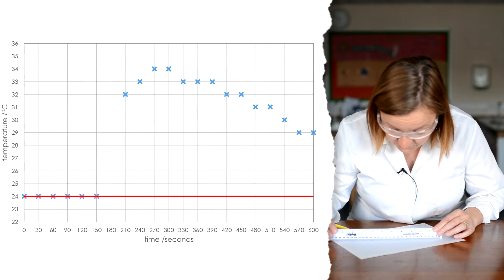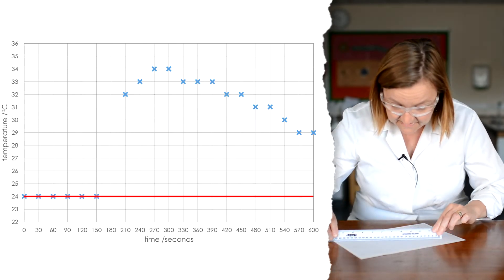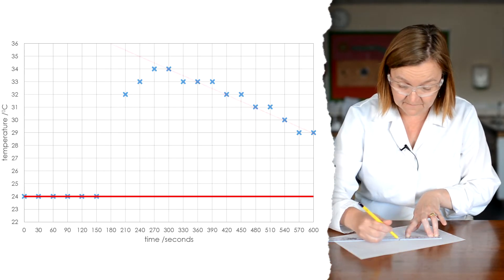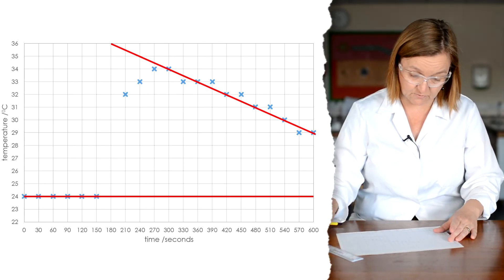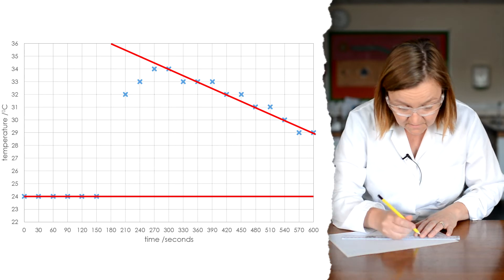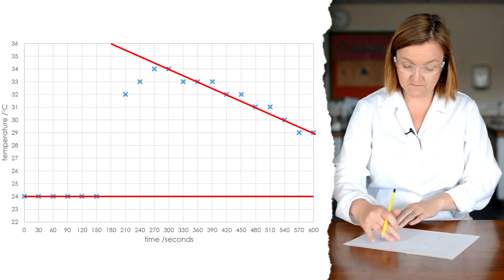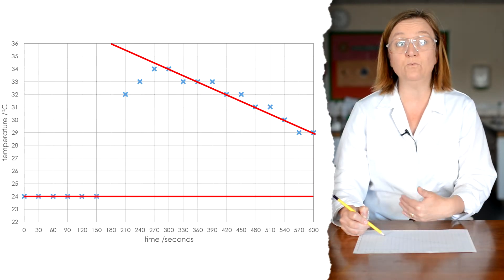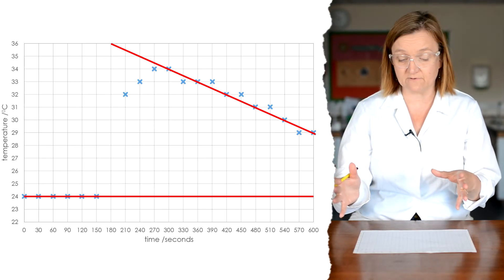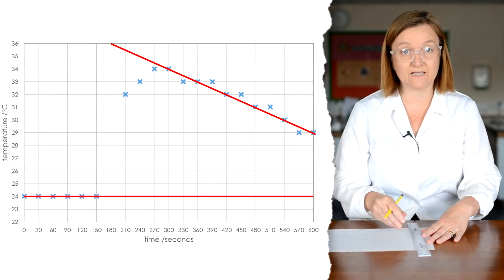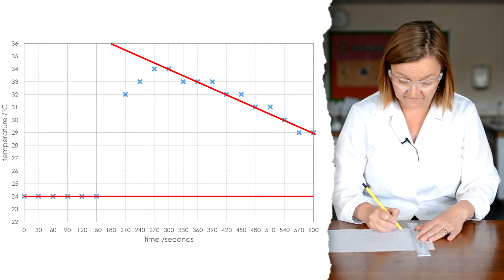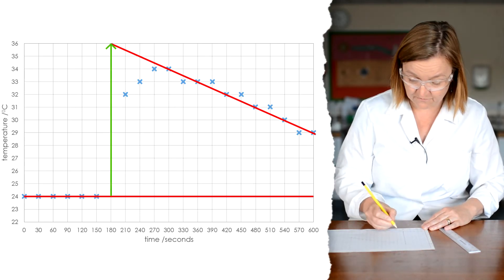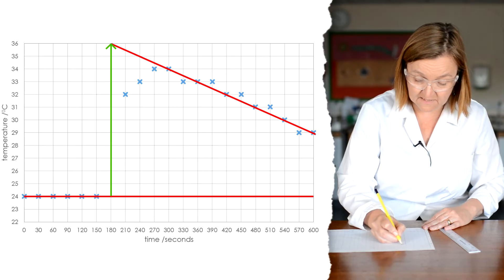And the way I can do that is put a line of best fit through the cooling part of the graph. Take my ruler and I need to make sure that my line of best fit in this part of graph is going through the centre of those points with an equal distribution on both sides of the line. And then I'm just going to make sure this line is continued so that it crosses the point where time was three minutes. Now, if you like, this would have been the temperature it would have reached if all of the energy had instantly been released. From my graph, I can now work out that maximum temperature change that I should have been able to achieve at three minutes.